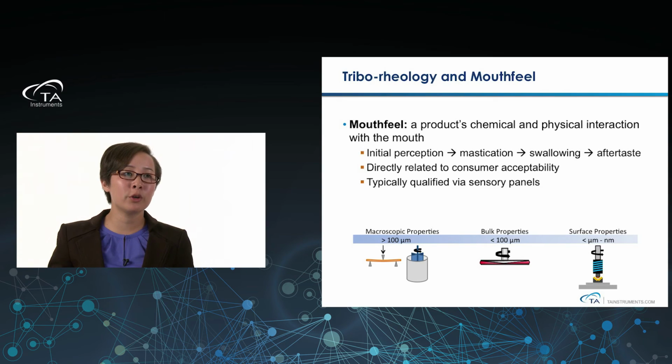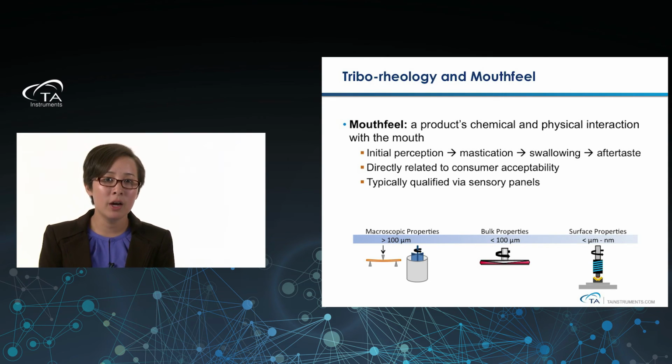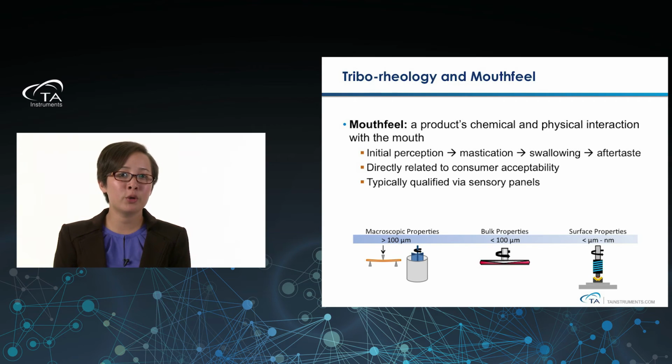So in this case, what we're going to do now is kind of switch gears a little bit and talk about mouthfeel. So this is a relatively newer area that's coming to fruition as far as using tribology is concerned. But with mouthfeel, you want to look at how a product's chemical and physical interaction is within the mouth.